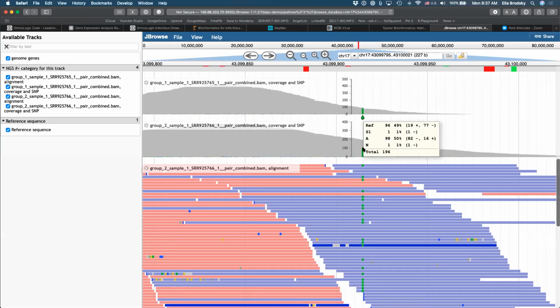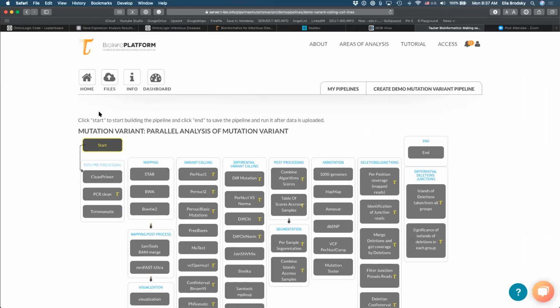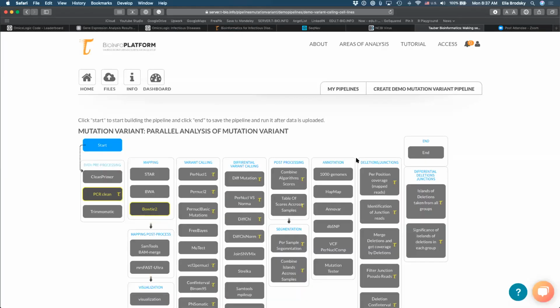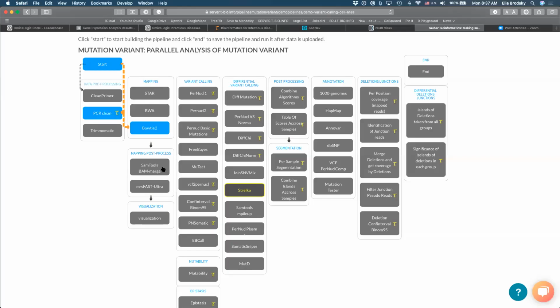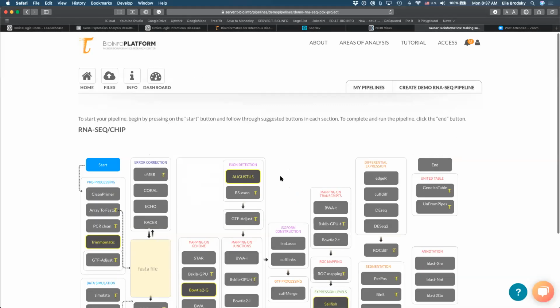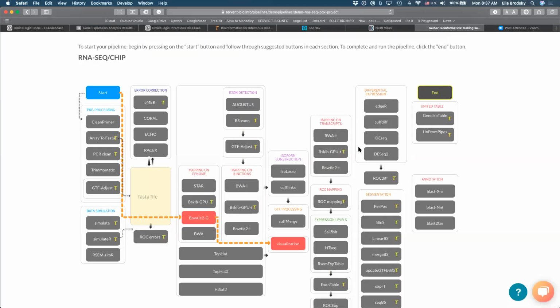The other use case here, and let me do another quick demonstration, is when our reference is one organism, for example the host, but our input data, we suspect, has sequencing reads from both the host and the pathogen. So here I'm going to do some pre-processing on my data, and then map it again. Okay, sorry, not here. I'm just going to go quickly to another section. I'm going to perform essentially the same process: map on the reference genome, find the visualization tool, and look at a different type of sequence that was mapped to be able to identify a particular type of genome.